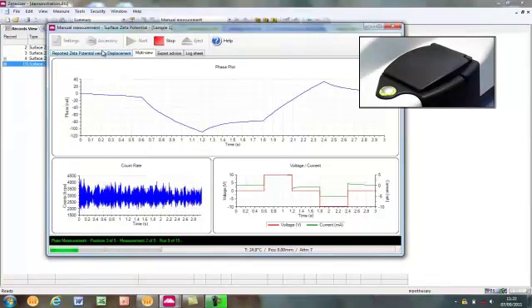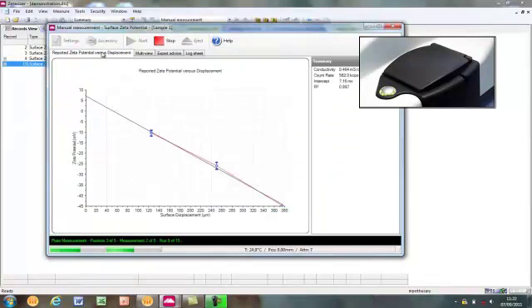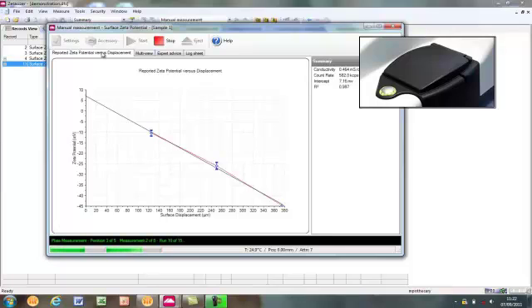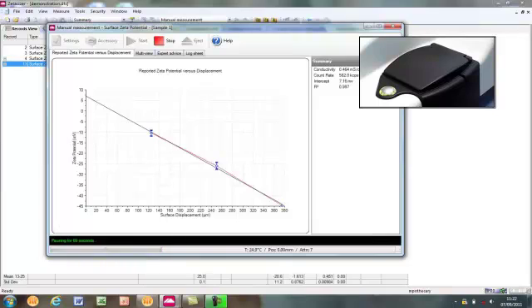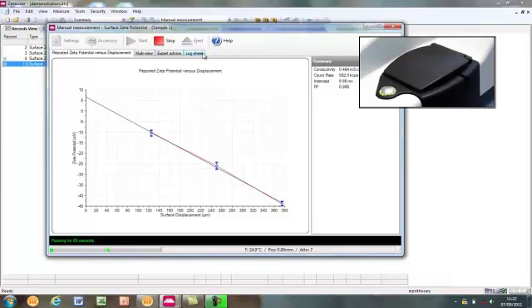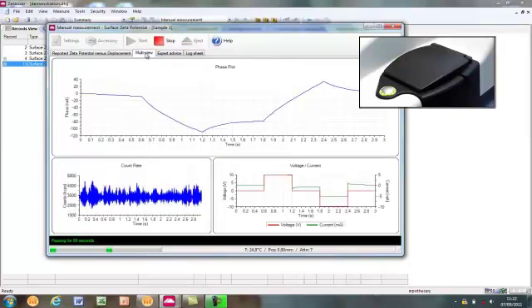As the measurement progresses, the plot of reported zeta potential against displacement develops. This can be seen in any of the report tabs, but here is shown in the single viewed tab of the live measurement display. The plot shows the mean and standard deviation of the reported zeta potentials at each displacement. Individual points are added to the graph as the measurement progresses. The current calculated intercept is reported on the right-hand side of the page, along with the conductivity, sample count rate, and r-squared value of the fit.